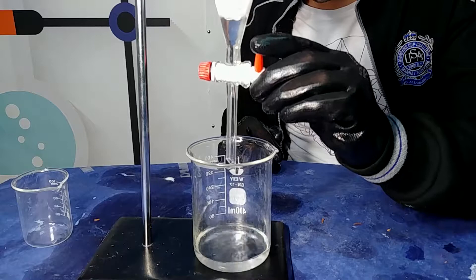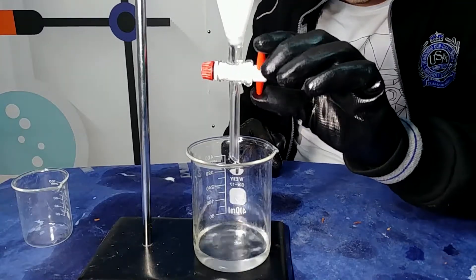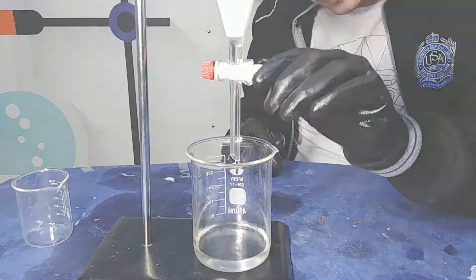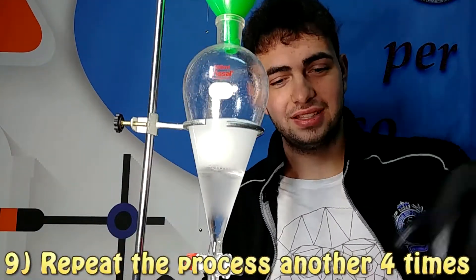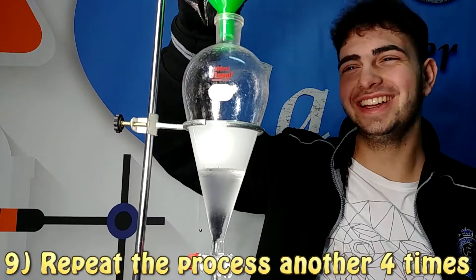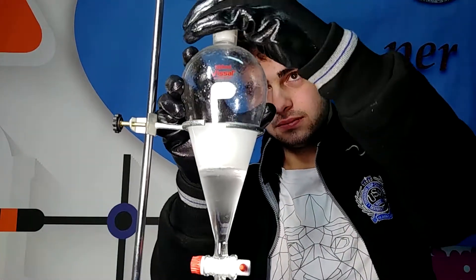After that we are going to repeat this procedure another four times and then we are going to gather all our dichloromethane in one beaker. So we know when we are done with our distillation process when the solution in our beaker is really clear.